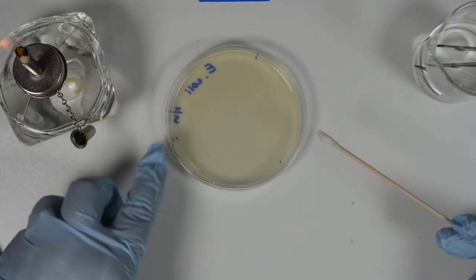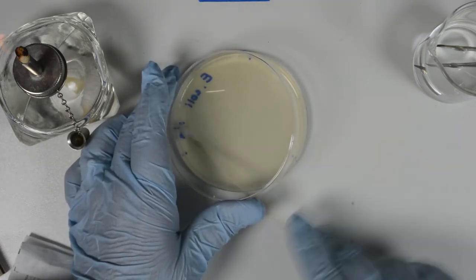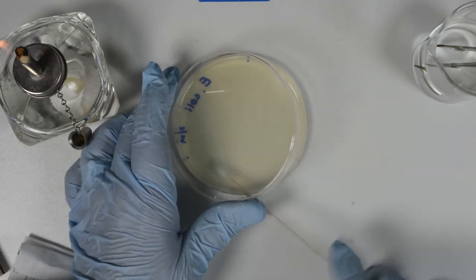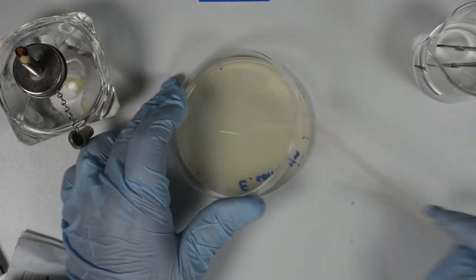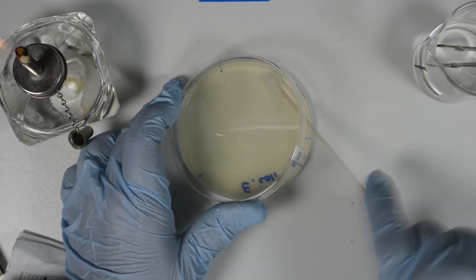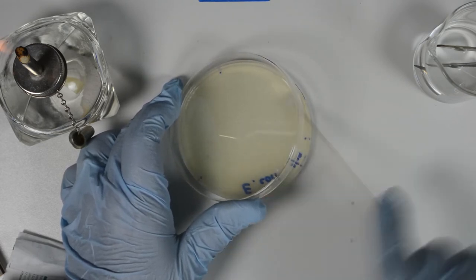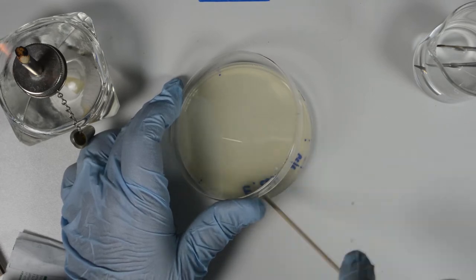Rotate the plate one third of a turn. Cover the surface of the agar as evenly as possible, just like before, keeping the lid as a shield. Rotate the plate another third of a turn and cover the surface of the agar as evenly as possible. Then run the swab around the edges to remove any excess liquid.